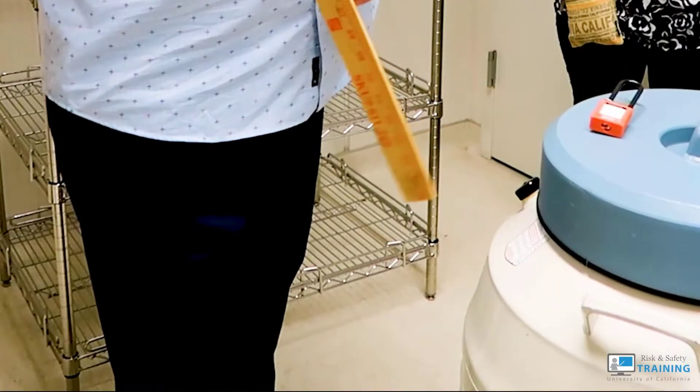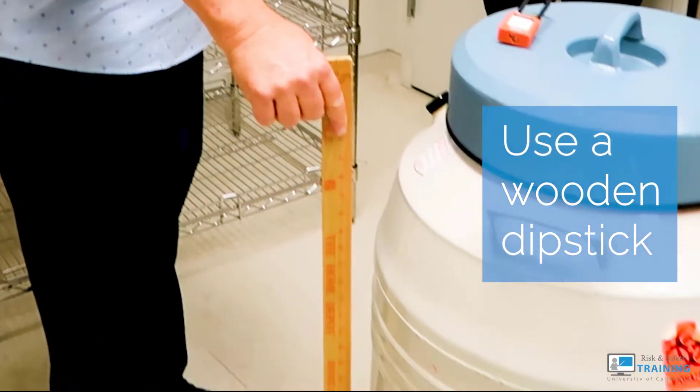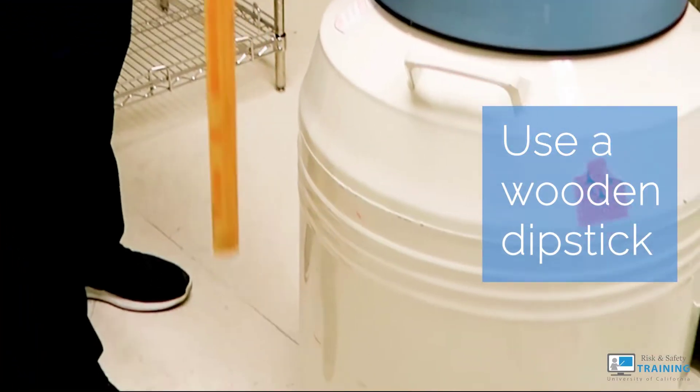When filling larger cylinders, use a wooden measuring stick — dip it into the container and use it as a dipstick to determine the levels.